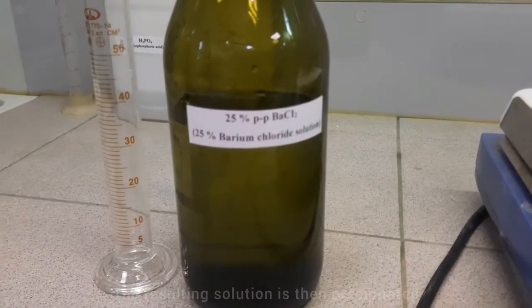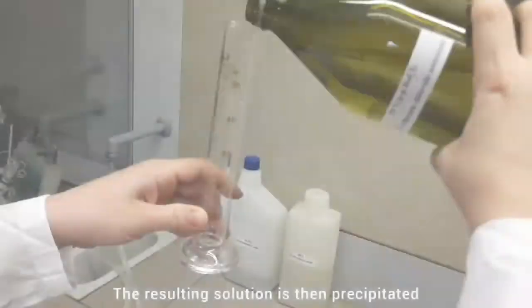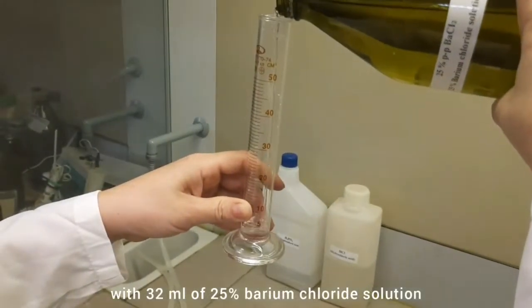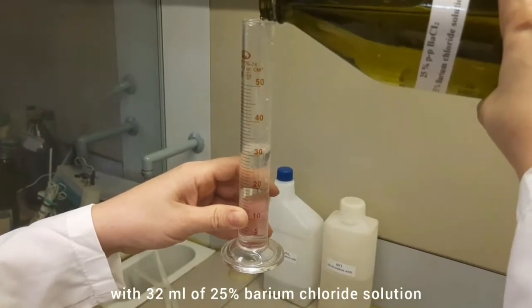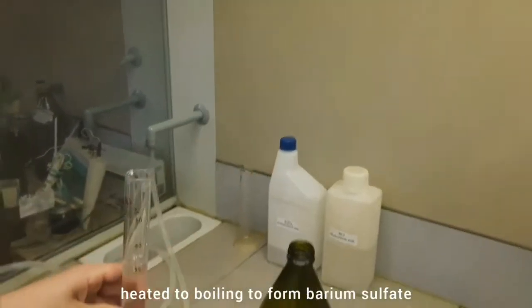The resulting solution is then precipitated with 32 ml of 25% barium chloride solution heated to boiling to form barium sulfate.